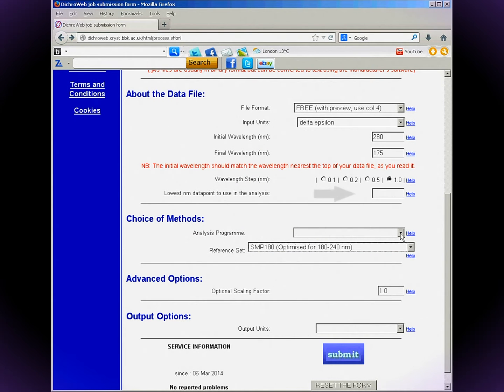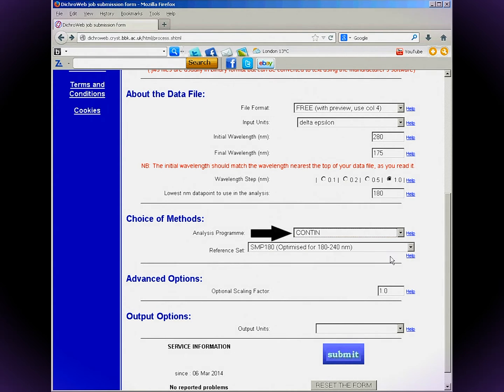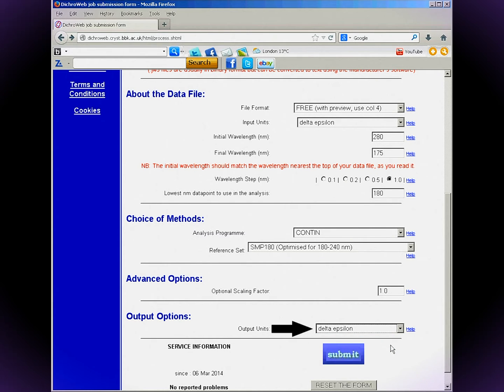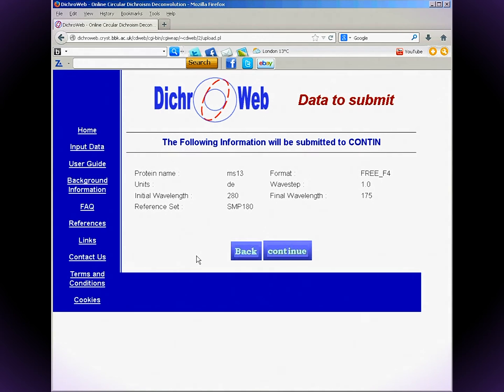Enter the lowest wavelength to be analyzed — this should be the lowest wavelength in the data set. Choose the CONTIN analysis program first, then enter the output units. I suggest delta epsilon or mean residue ellipticity. Click Submit.